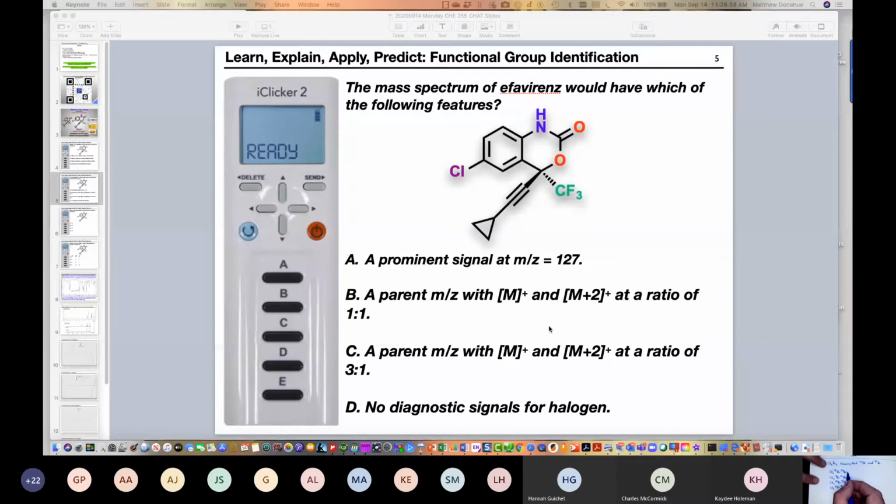Now you consider this is unique, right? That occurs once. Look at these next two. We've written 79Br 81Br, then 81Br 79Br. So essentially, this is occurring twice. Then the last one, they're both 81, so that's occurring once. So what is all of this telling you? That in the parent region, M over Z, you should now see three peaks in a 1:2:1 ratio.